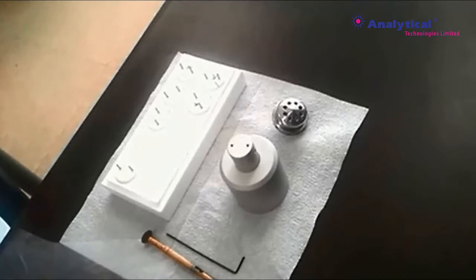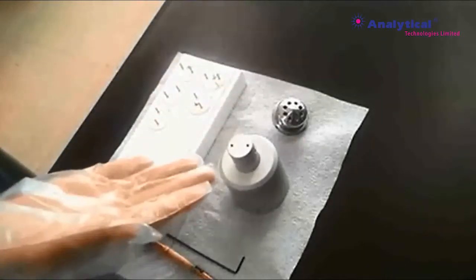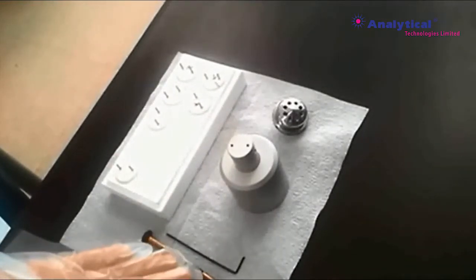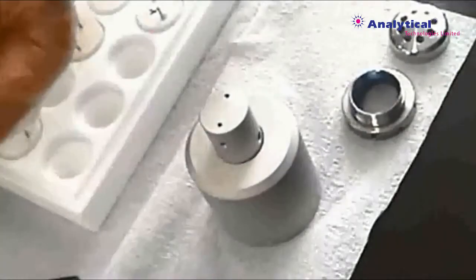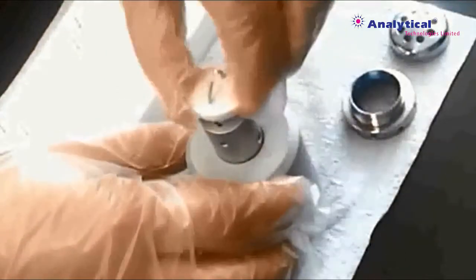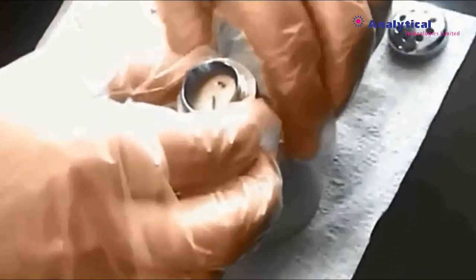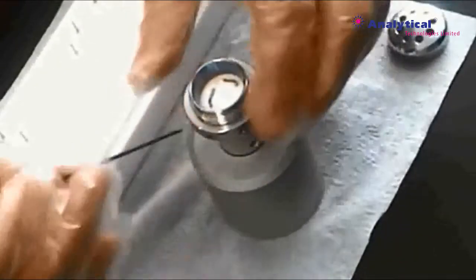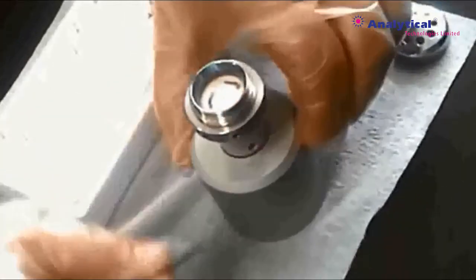To combine and align the filament and wehnelt cylinder, prepare the filament, wehnelt cylinder, filament jig, sanitary gloves, 1.4 mm hexagonal wrench, and 1.4 mm flat head screwdriver. First, put the gloves on and insert the filament into the jig and secure it. Cover the filament with the bottom part of the cylinder. Then, by using the hexagonal wrench to adjust four screws in the bottom part of the cylinder, center the filament.